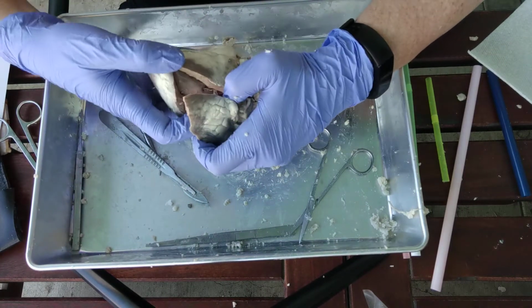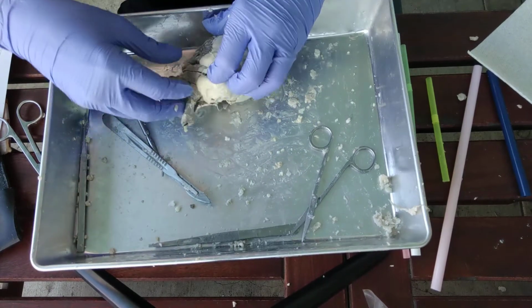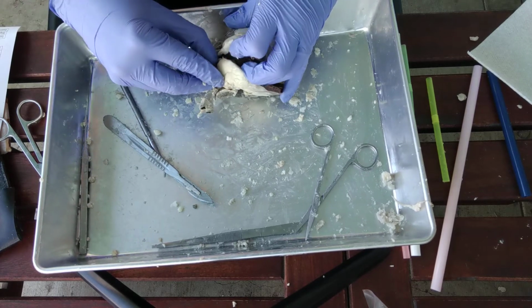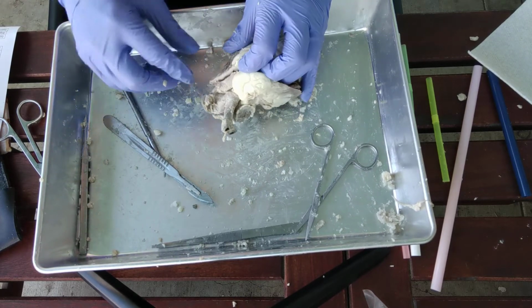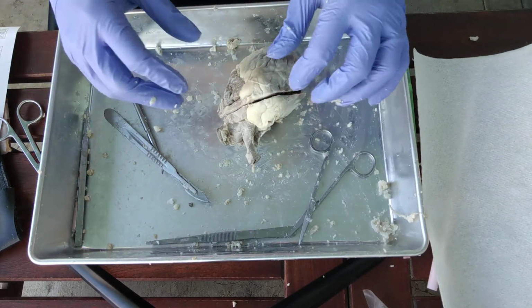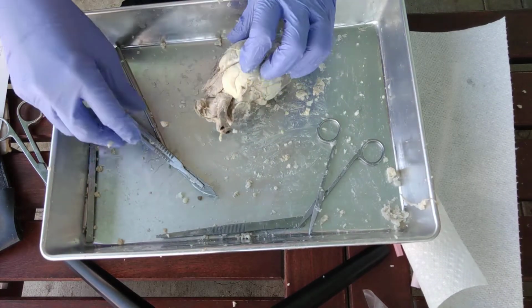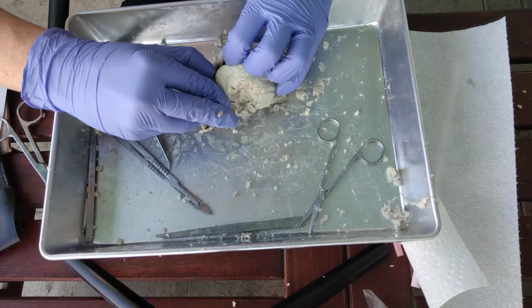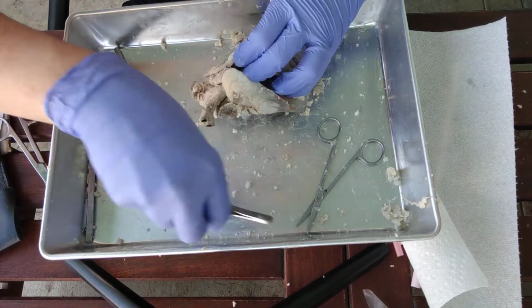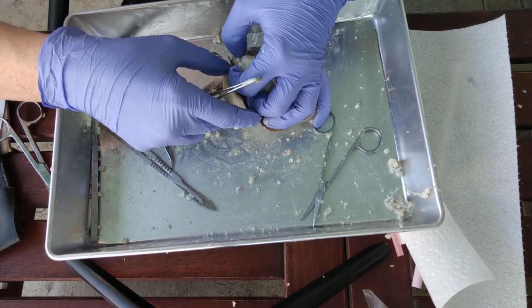Okay, so let's see. First of all, this right here, that's the moderator band. Now let's try to find the valve. There are two semilunar valves, and the semilunar valves are called that because they look like little crescent half moons. The two semilunar valves are going to be between the ventricles and the arteries. And this would be the pulmonary semilunar valve, or often just referred to as the pulmonary valve. Having a little hard time keeping it open and pointing at things at the same time.